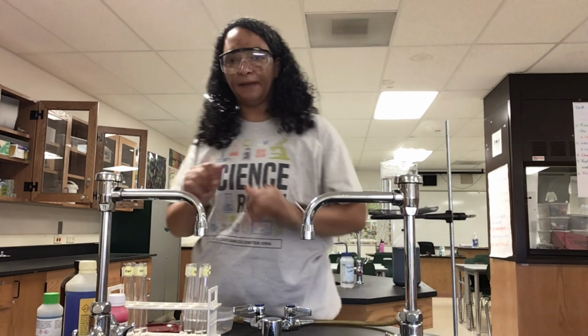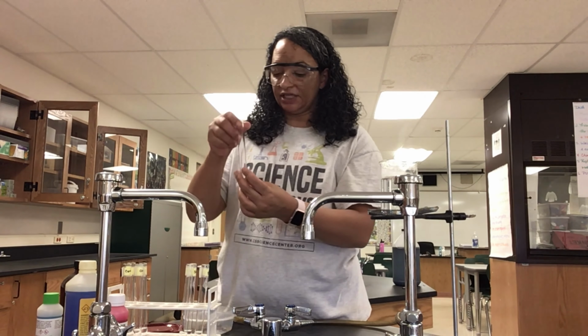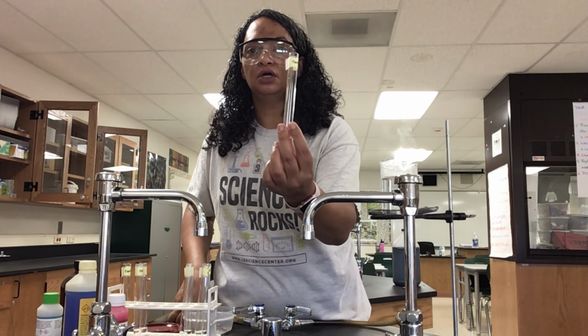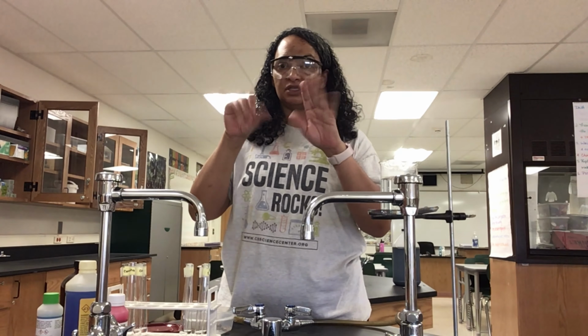Bad teacher. All right. So I have 8 test tubes set up here. I have 4 test tubes that say seed on them. These are going to be the ones I actually put the seed into. And then I have 4 test tubes that say control. So these ones are not going to have any seeds. And I've gone ahead and already put some distilled water in all of my test tubes just to kind of make our lives a little easier.